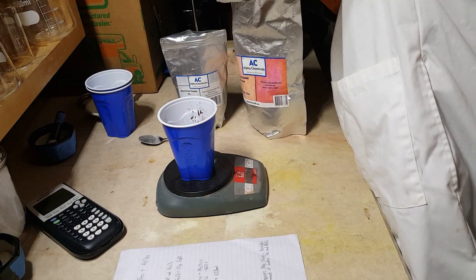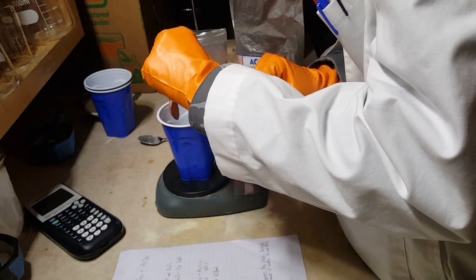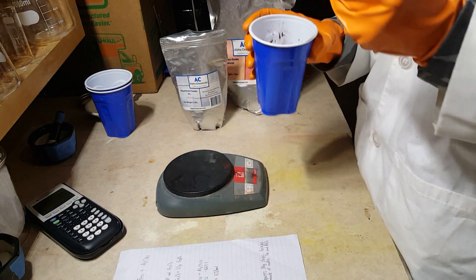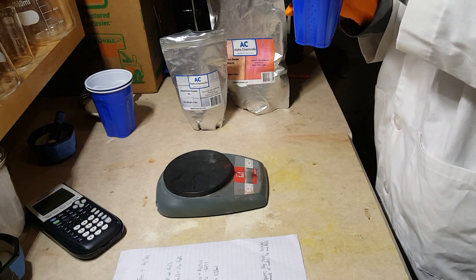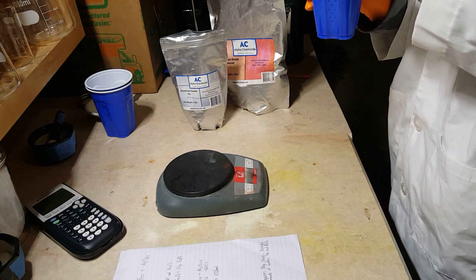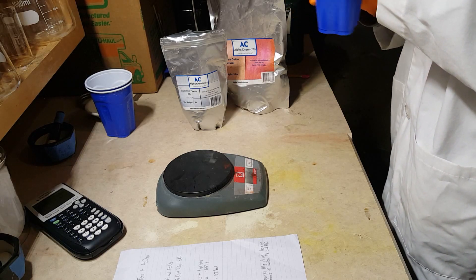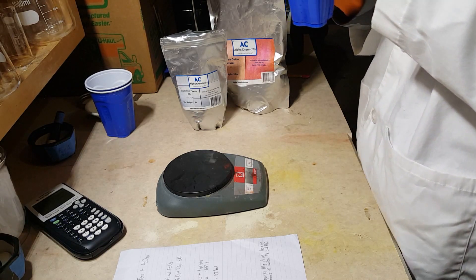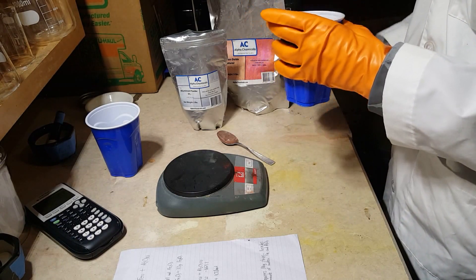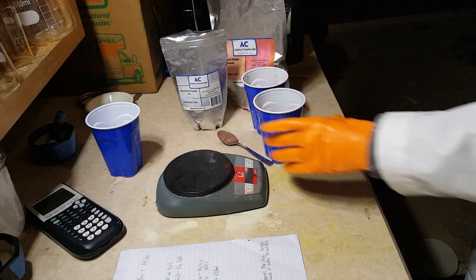A little more. Okay, close enough. You want to mix this stuff really, really well, because in order for two substances to react, they have to actually physically collide. For example, if I don't mix this very well and all the aluminum is at the bottom and all the iron oxide is at the top, then only the parts of the two substances that are actually touching will react, and we won't get our desired pool of molten aluminum oxide and iron. Alright, it's mixed pretty well now, so I'm going to put this all in a soda can.